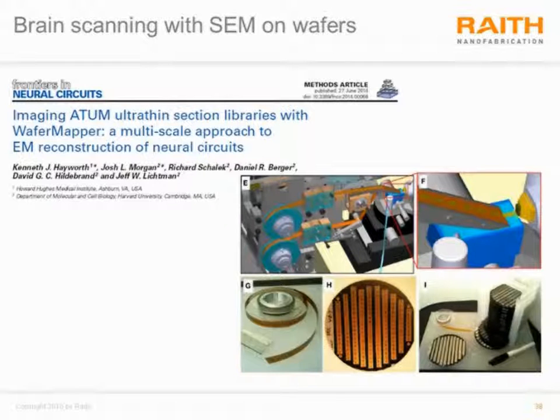Quite a lot of effort has gone into properly preparing these samples, to fixate these cells with osmium tetroxide and further with uranyl acetate, and preserve the ultrastructure and the myelin sheaths. It is quite an art in itself. So there are a variety of ways of preparing these samples, and so it's important to have flexible instrument detection capabilities.